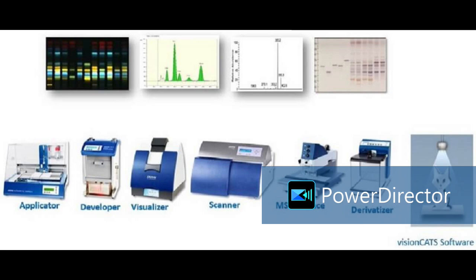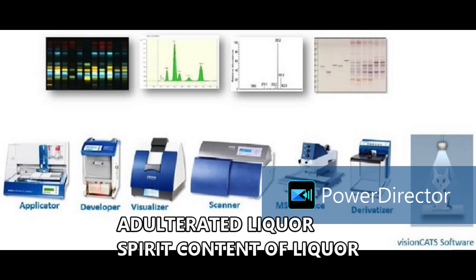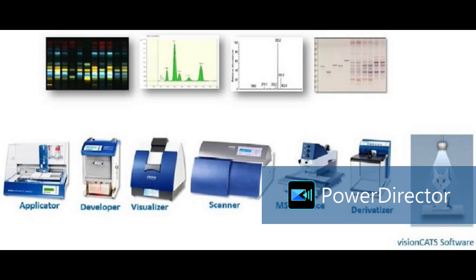So can that also detect the adulterants? Because most of the liquors are being banned, not for the content of these things, but for more adverse things, spirit and others like methanol and chloral hydrate added, which can create harm to the body. They are all liquid adulterants and volatile in nature mostly, so GCMS is a good technique for that. Not this. This is very good for dyes etc.